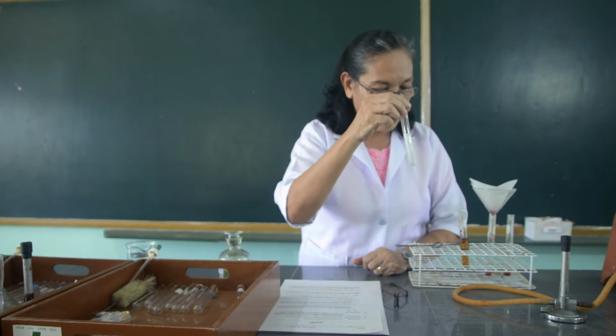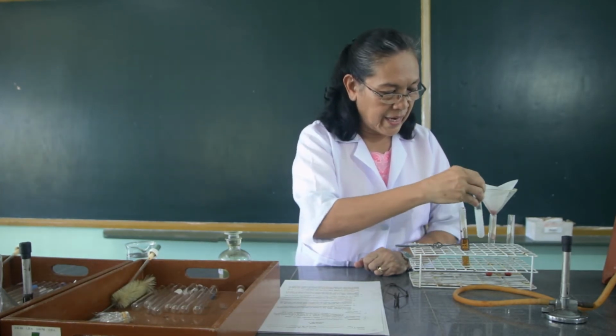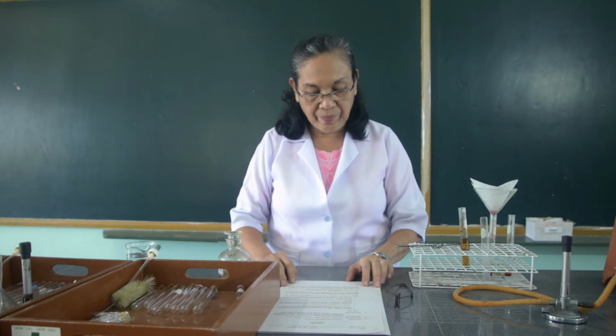And we will let this settle for a while. Let's set it aside here. And we will have another observation later.